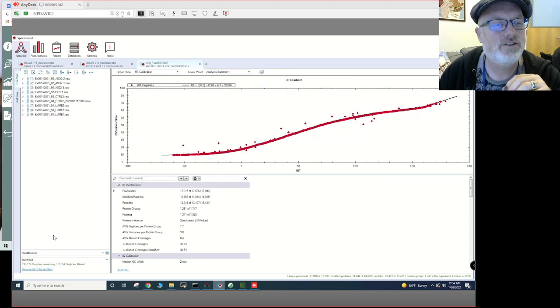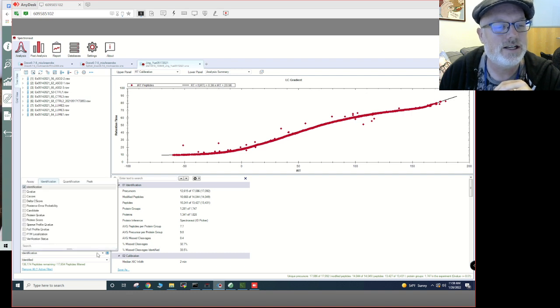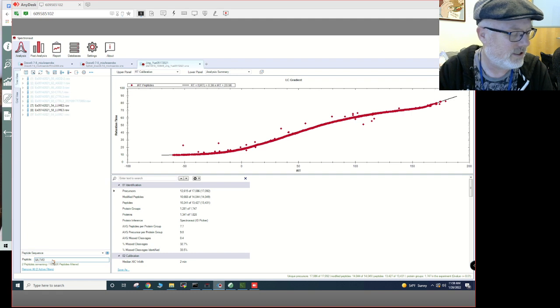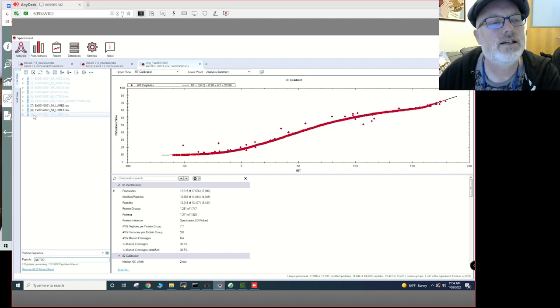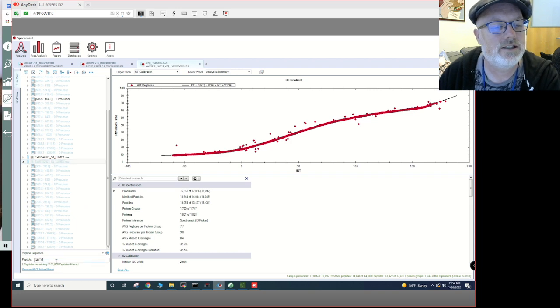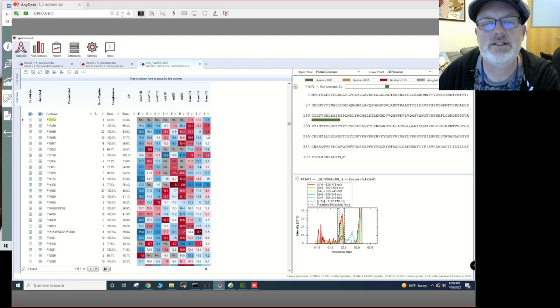We go to tree view, and we want to pull out this identification. So we'll do the drop down and say sequence, which should be peptide sequence here, and then we type in the sequence GILTVD. There it is here. Why it's not showing up there? Was that our sequence? It should be in all of them. And they're not. And let's figure out why.